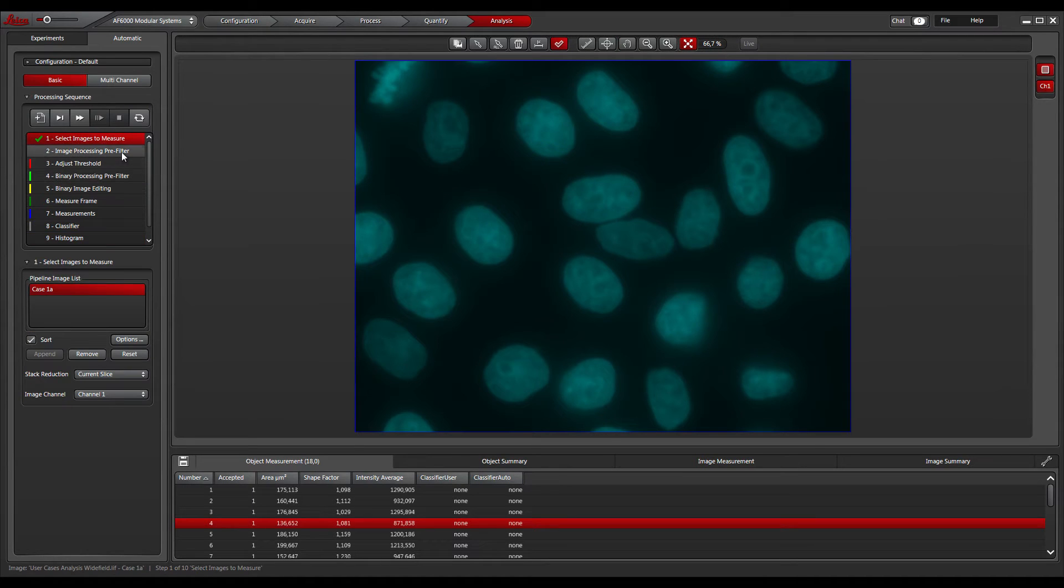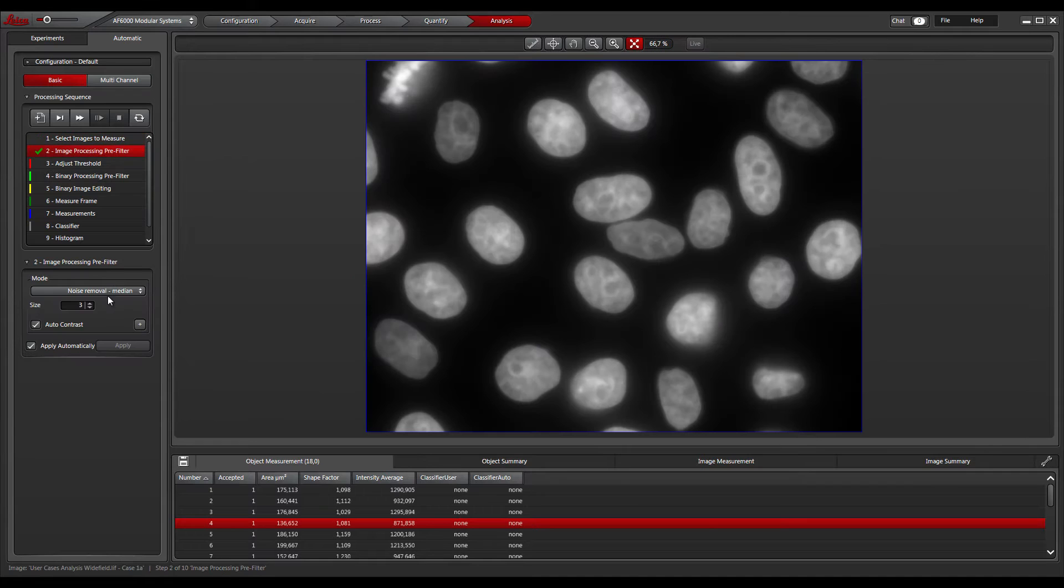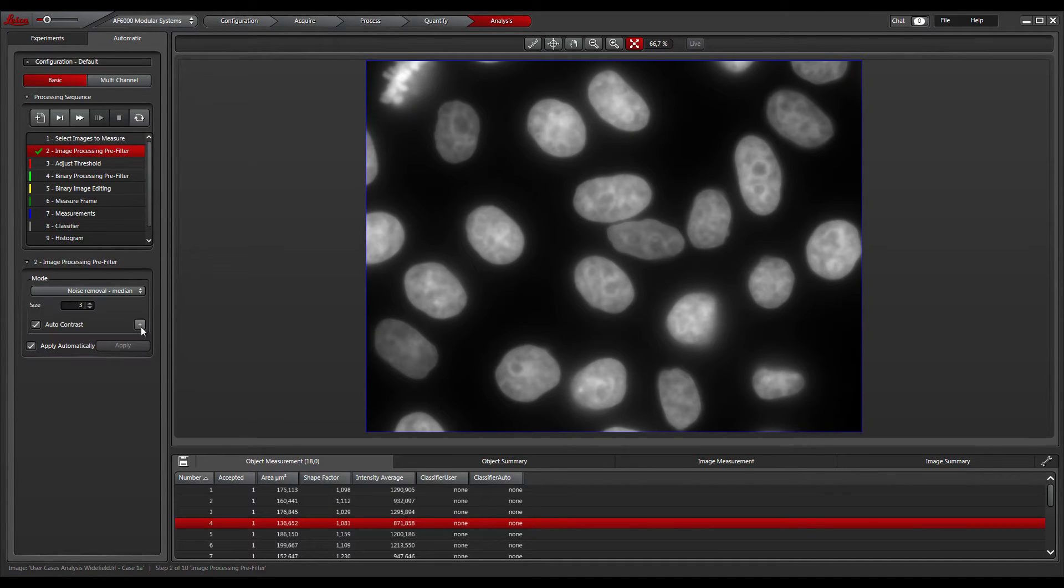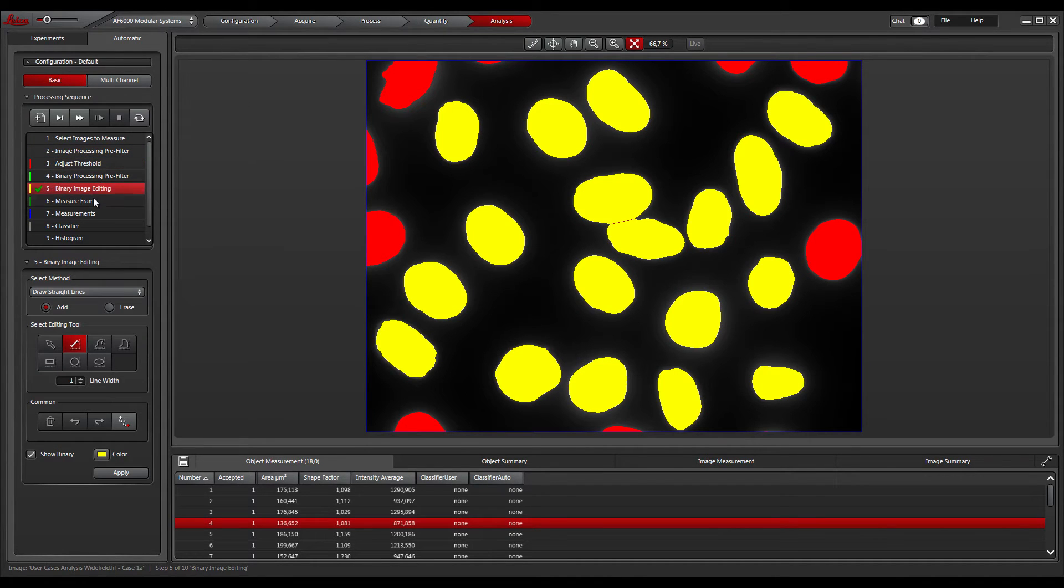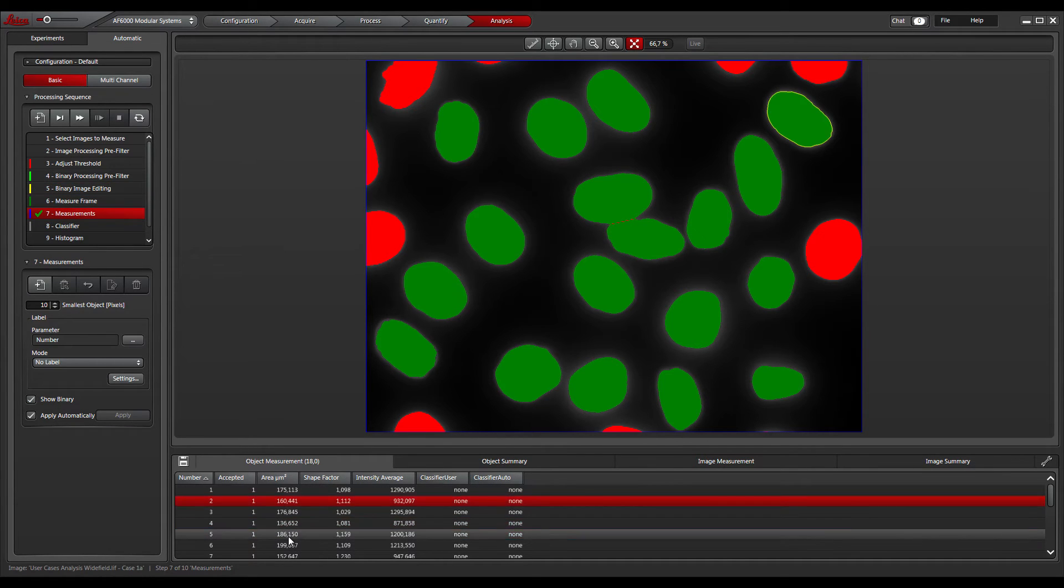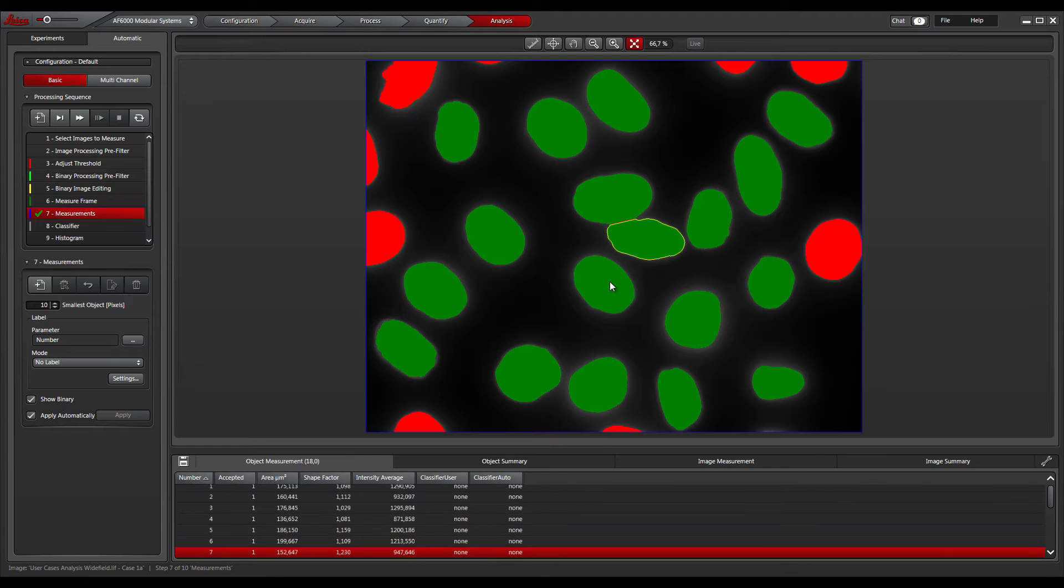The Image Analysis Wizard guides you through the analysis of multi-dimensional data sets. Go step by step through the guided workflow, from image processing to measurements and classification. For repetitive analysis tasks, user-defined protocols can be saved and applied to new data sets.